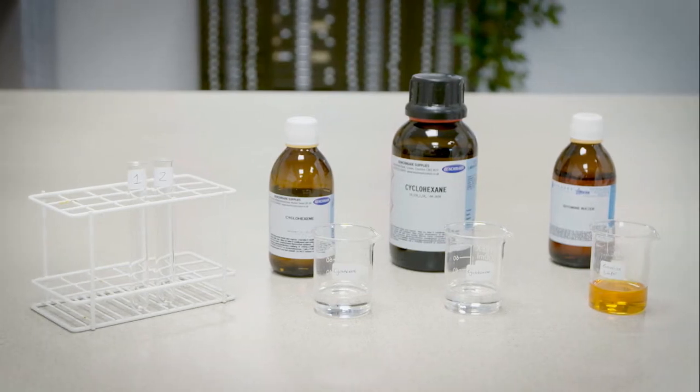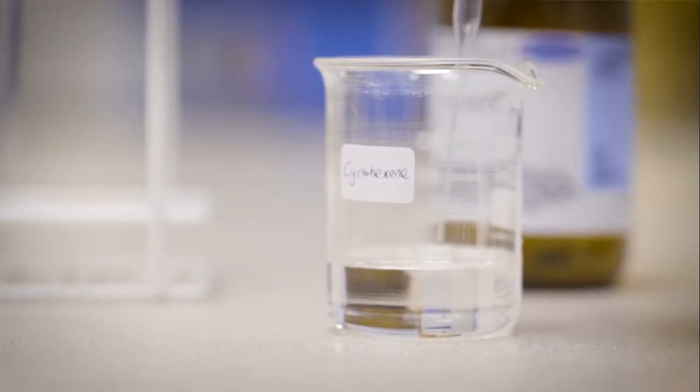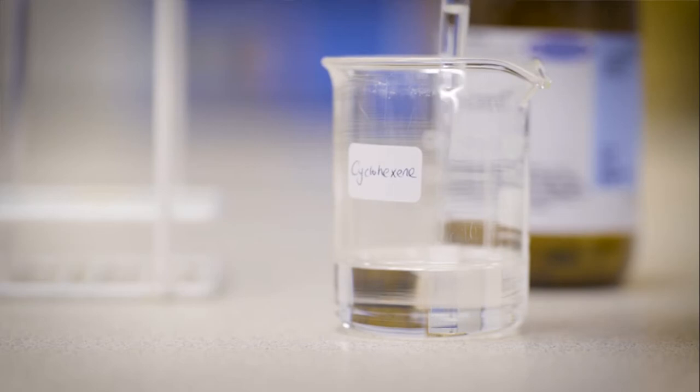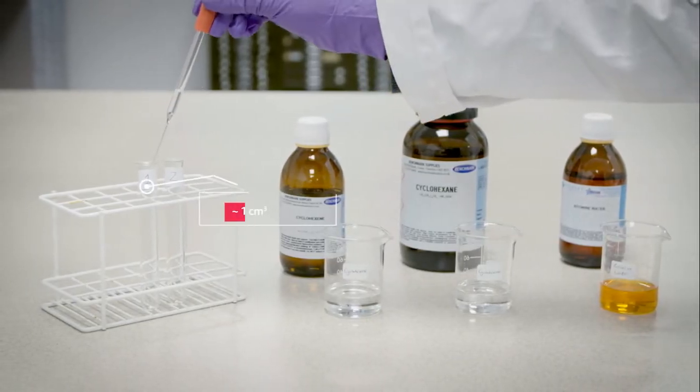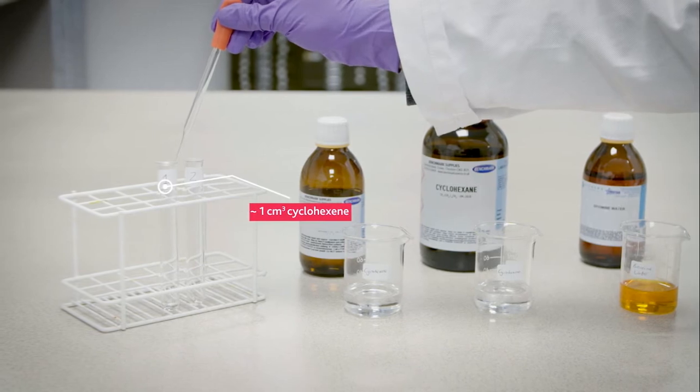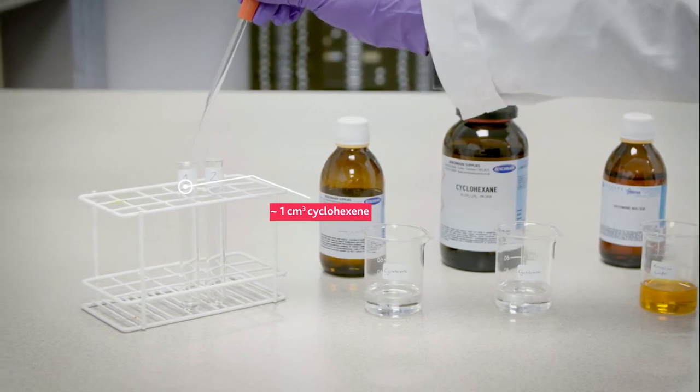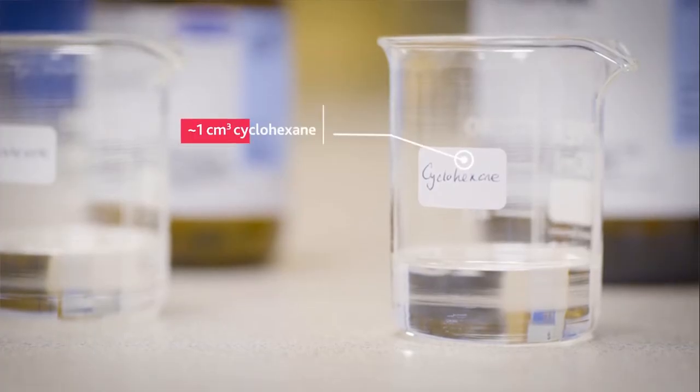Two test tubes should be labelled 1 and 2. In test tube 1, cyclohexene is added. In test tube 2, cyclohexane is added.